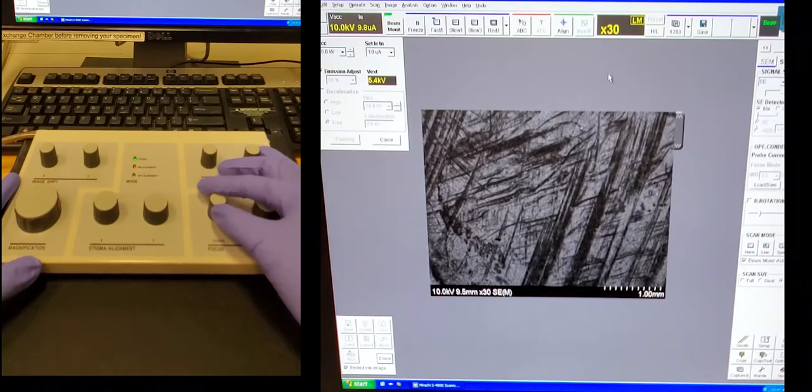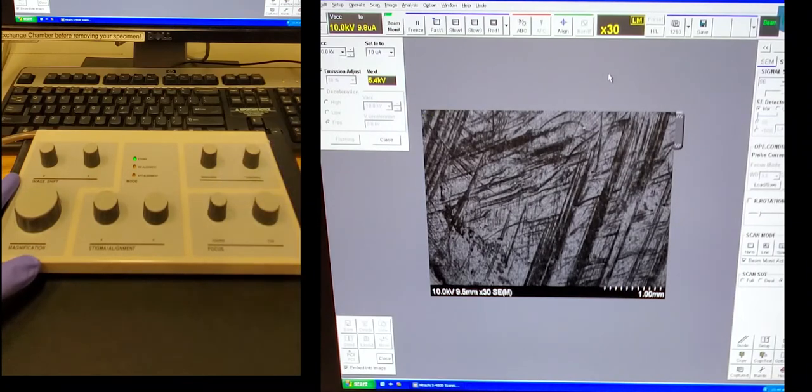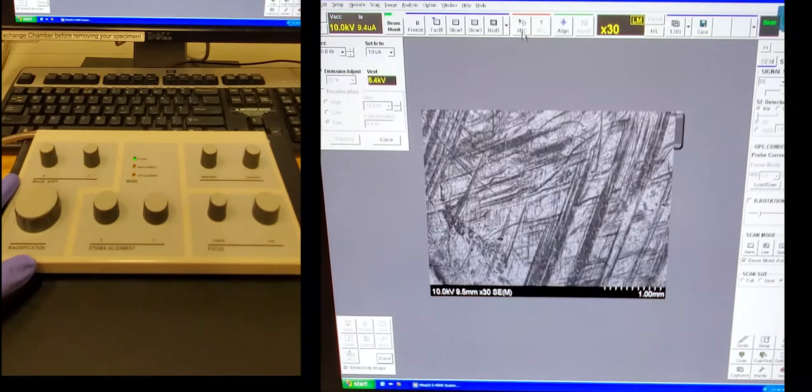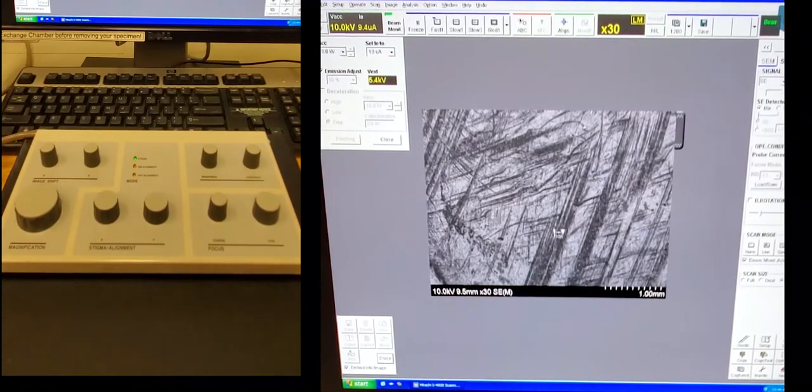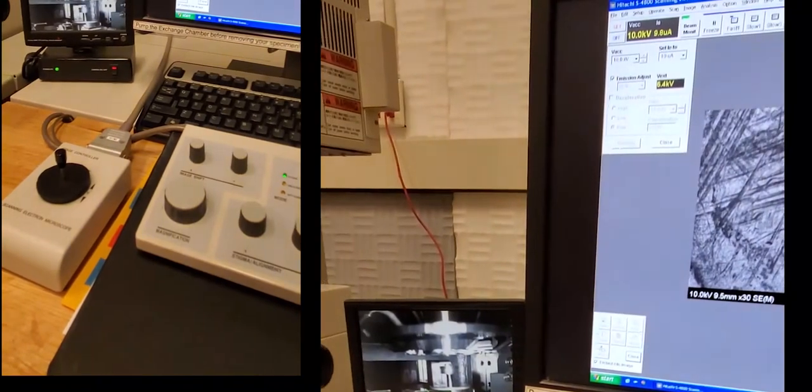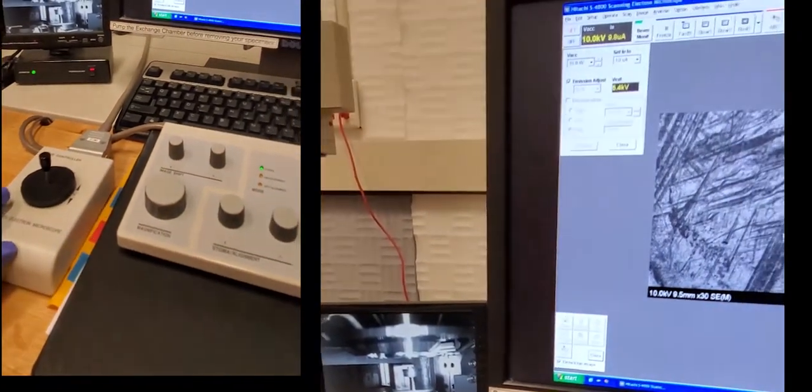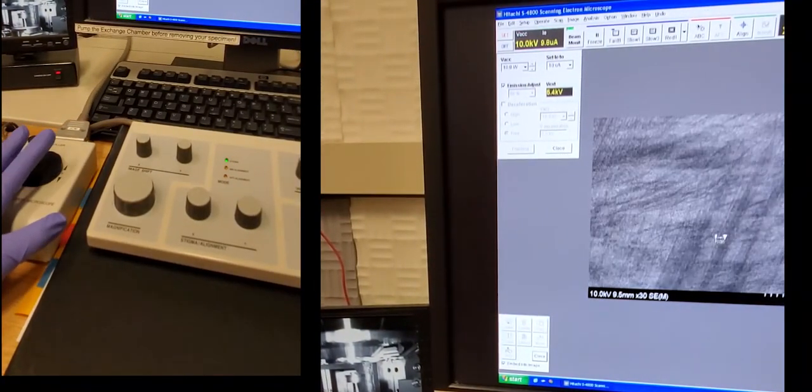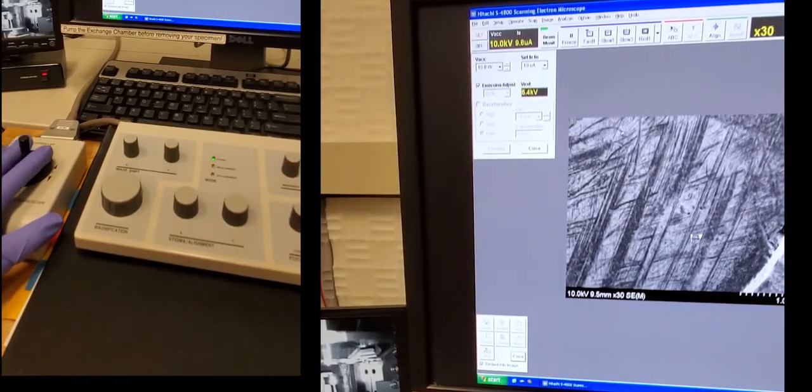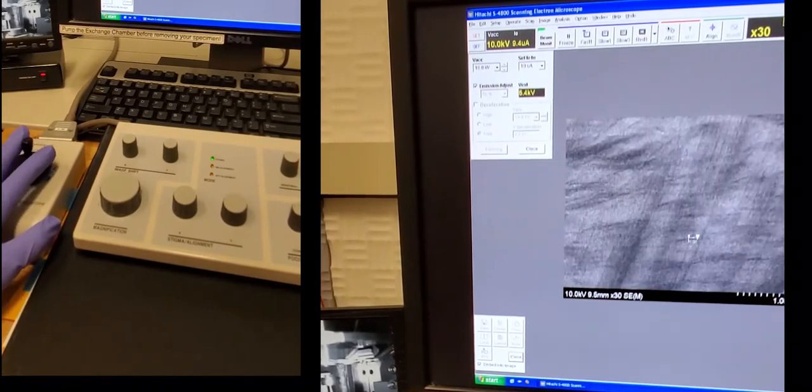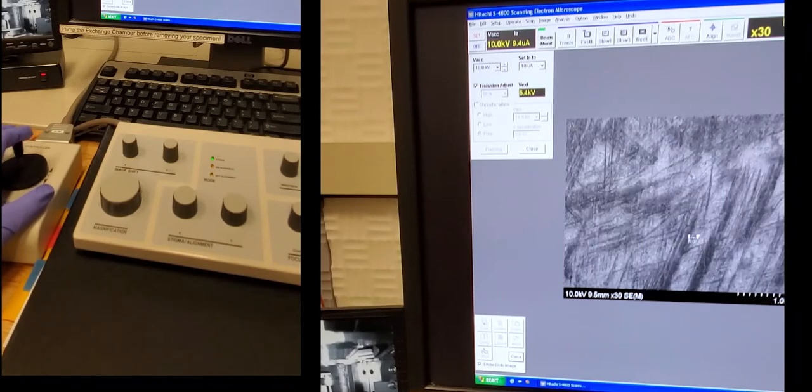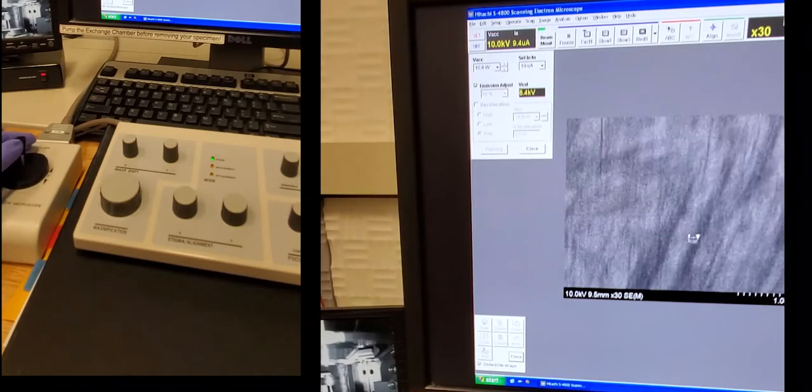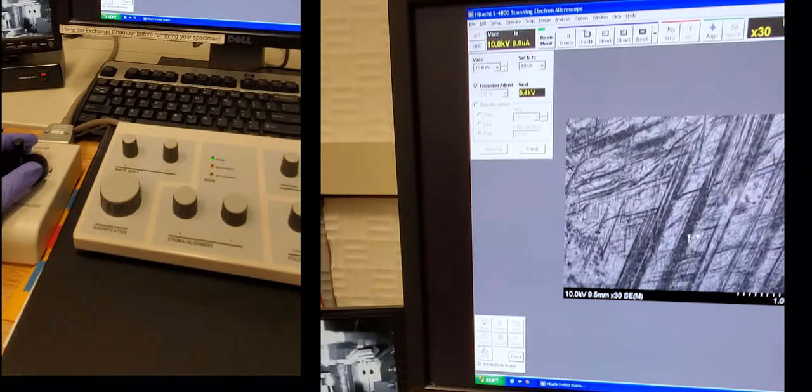First I'm going to do a coarse focus with this knob and bring the sample into focus. And we are at the low mag, and this is the lowest magnification that you can look at your sample with. You can click the ABC button to adjust the brightness and contrast. So we use low mag to find the spot that you actually want to image. So the next step would be to use this joystick here, and you're actually going to move around on the stage to look for the spot that you want to magnify in and take an image of.